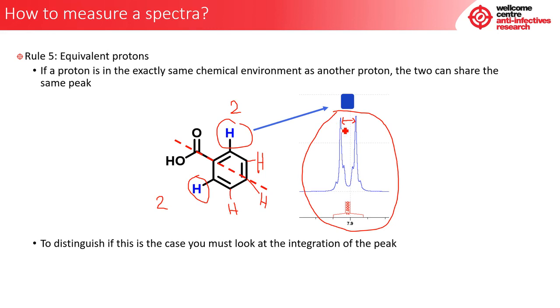There are 2 peaks here, and in doing so, this is what we hypothesized. However, the NMR is able to read the 2 identical protons, and in doing so, it creates what is known as an integration number underneath. It has measured the area of the peak, and it tells you the number of protons equating to this sample is 2.